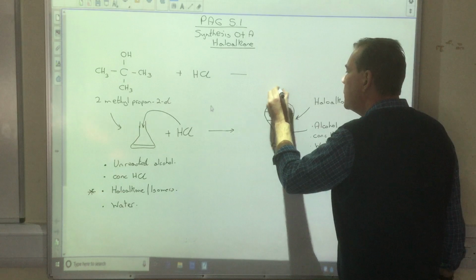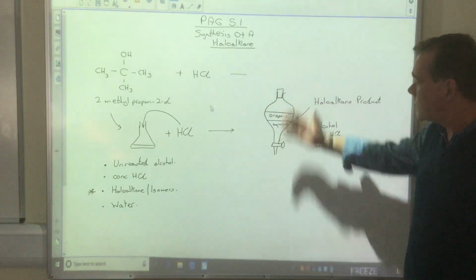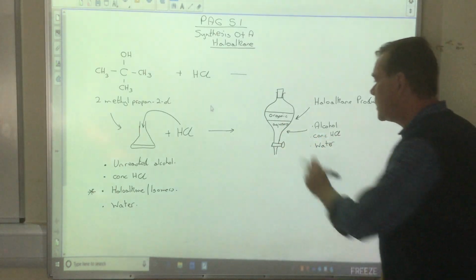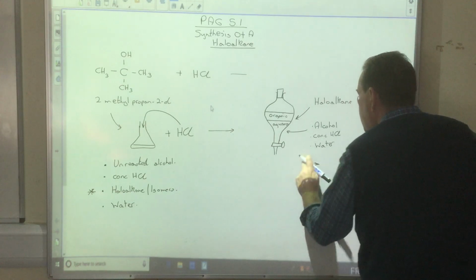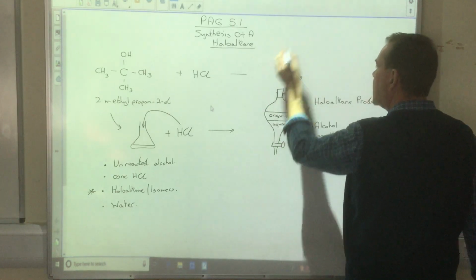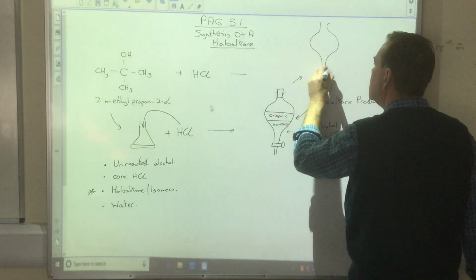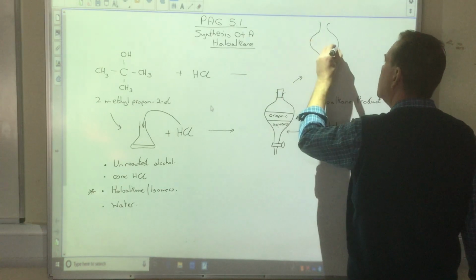You put a stopper in, but you must release the pressure, and you shake, so that it all gets nicely separated. Shake, and then run off the aqueous layer. So you undo the tap, and out the aqueous layer goes. And you know what you're going to be left with? Well, we'll go up here because I think it's easier for me to see, if nobody else. If you run off the lower layer, you end up with this.